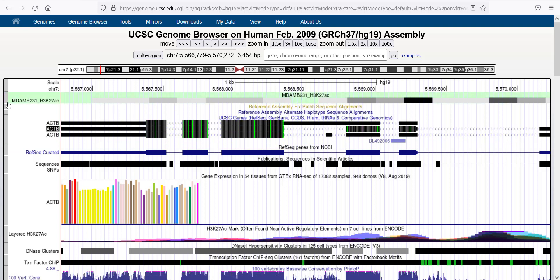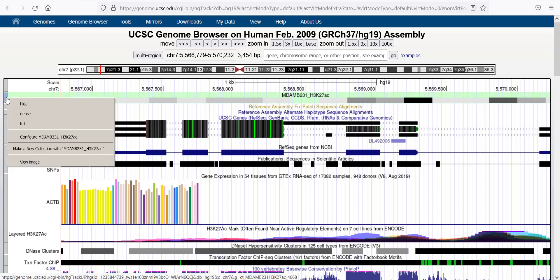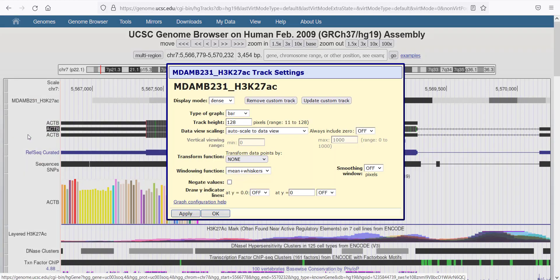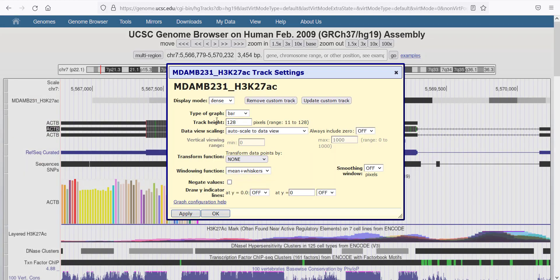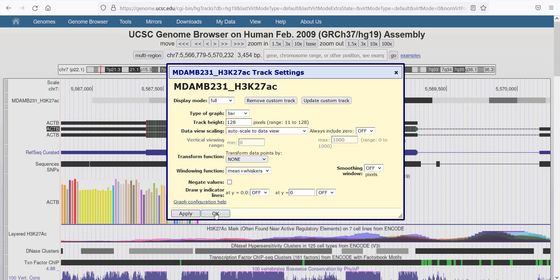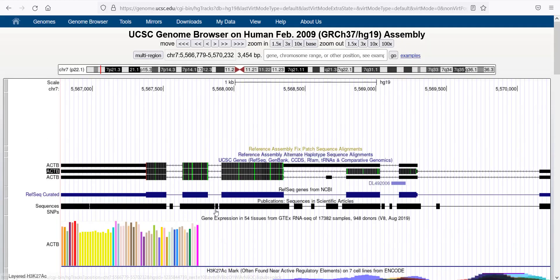I will then click on this over here on the left to configure the track. I want to display it as a full mode. And I will click OK here.